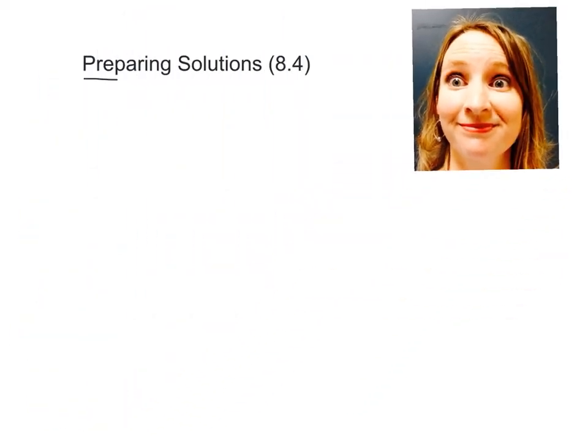We're going to be talking about ways to actually physically prepare solutions, because tomorrow we're going to start using some lab techniques to actually make solutions ourselves of certain concentrations. So not just randomly making solutions, but of known concentrations. So one way that we can prepare solutions is, write this, okay, from a solid.